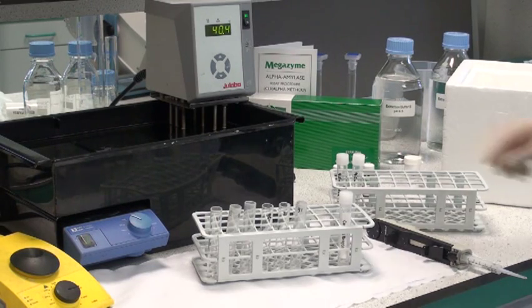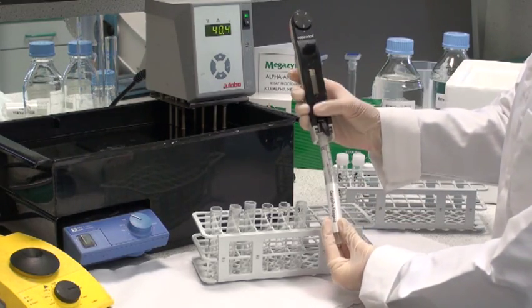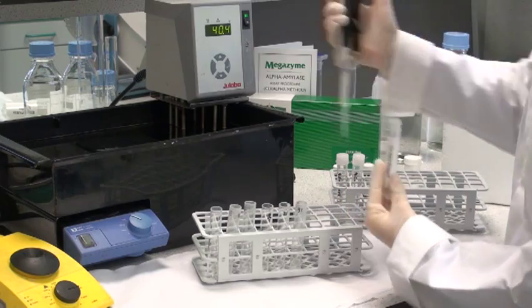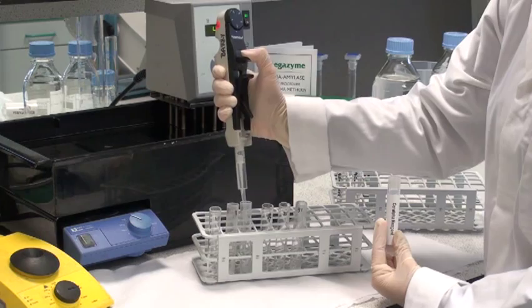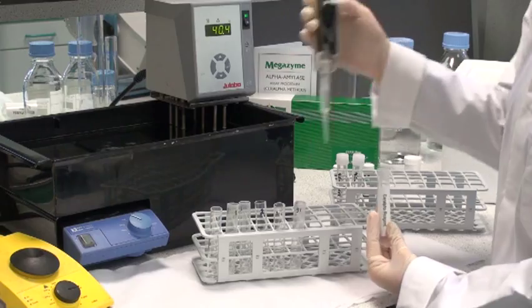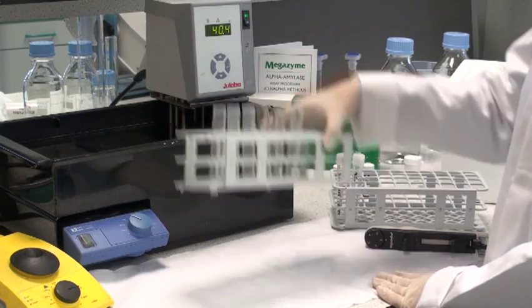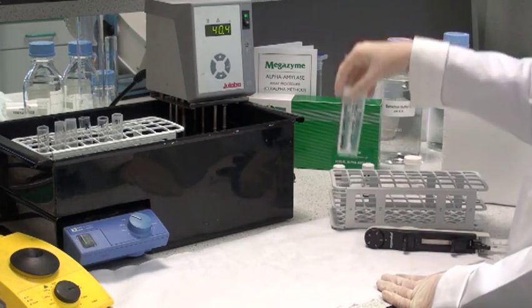Transfer 0.2ml of substrate solution into the tubes to be used for assay. Have 2 tubes for each sample, plus 2 tubes for blanks. Put excess substrate back into the substrate container, cap and place on ice. Put this rack of tubes at 40 degrees centigrade and pre-incubate for 5 minutes. Also add the enzyme extracts as well.